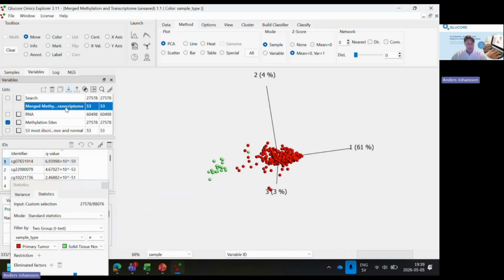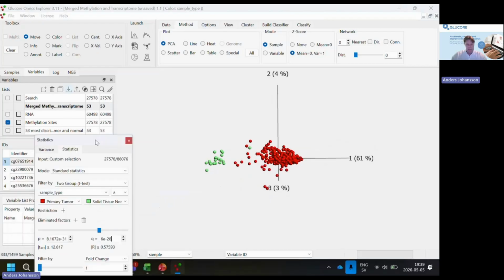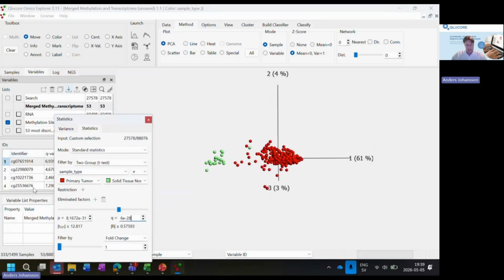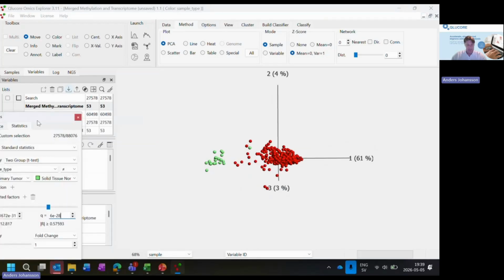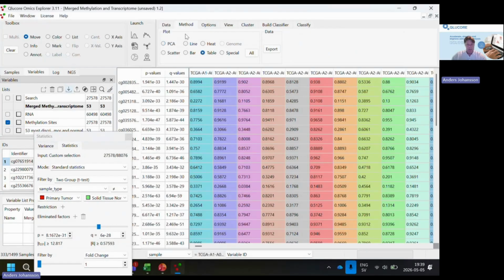So moving forward here, yes, we have been able to run a statistical test. We have many significant variables to choose from between these two groups. Let's investigate the up and down regulation a little bit more in detail. I will choose a new synchronized plot. I will keep this plot synchronized to the previous plot and the statistical test already done.